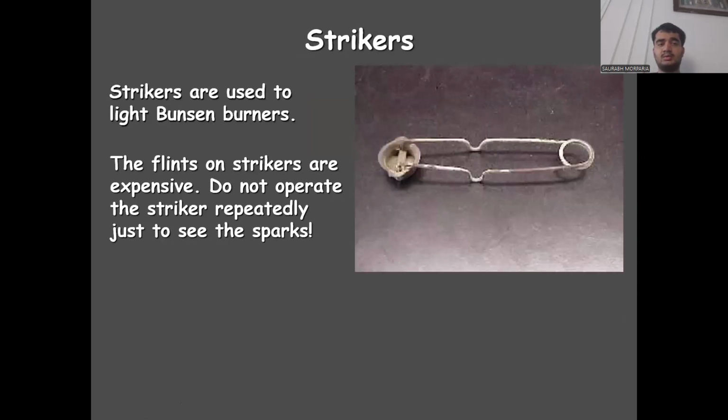Strikers are used to light the Bunsen burner. The flints on strikers are expensive. Do not operate the striker repeatedly just to see the sparks.